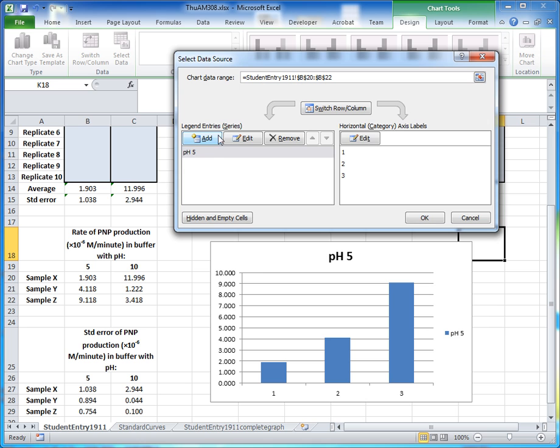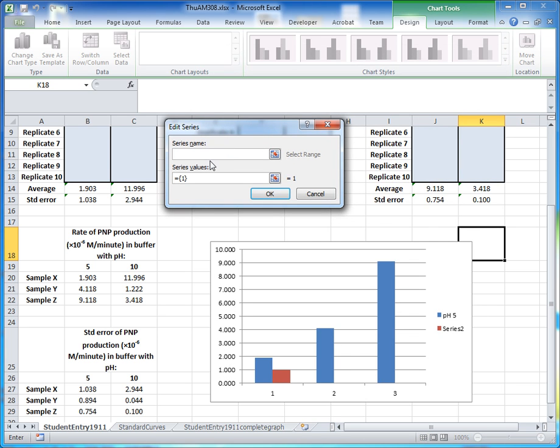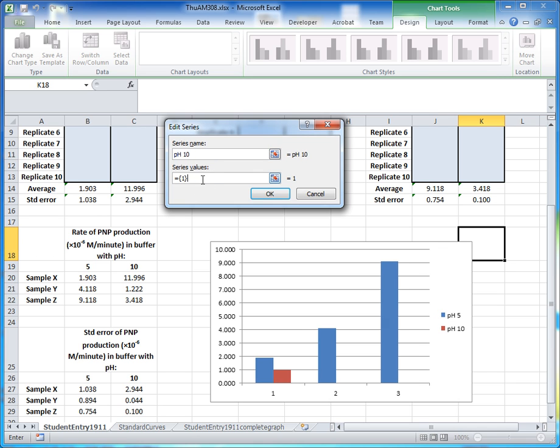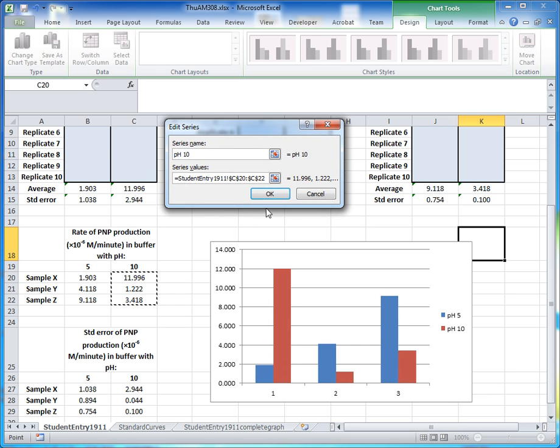Next, click the Add button again to add the pH 10 series. Specify the name as 'pH 10', delete anything in the series values box, then select the pH 10 average values from the spreadsheet and click OK.